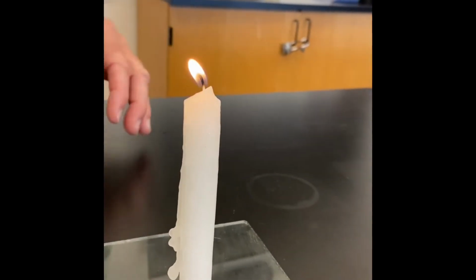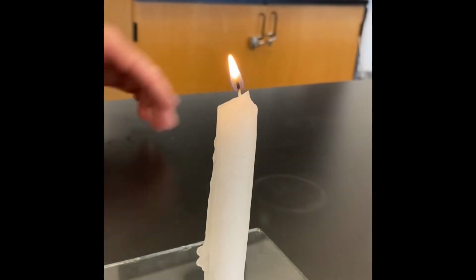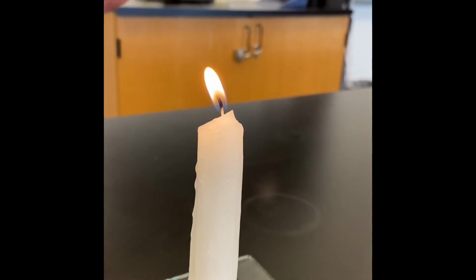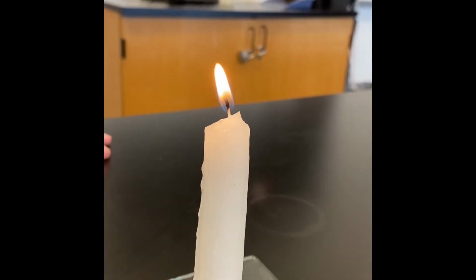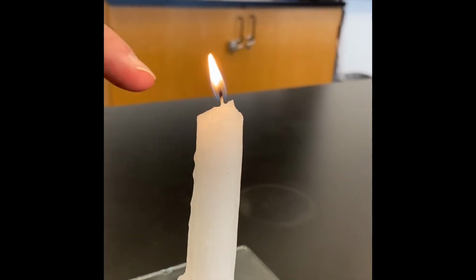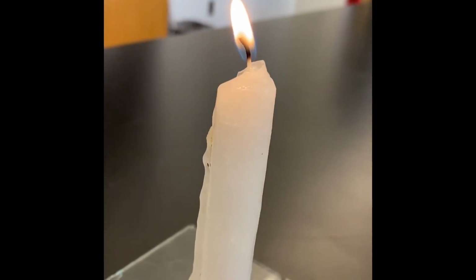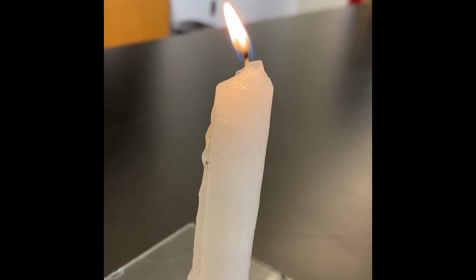We could see the flame is giving off light. It's wafting back and forth a little bit. If you were close enough, you could feel some heat being given off by the flame. And I could see some wax melting, going from the solid to the liquid phase, and dripping down the side of the candle.